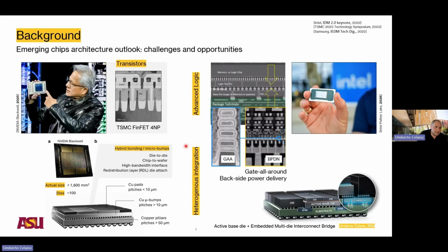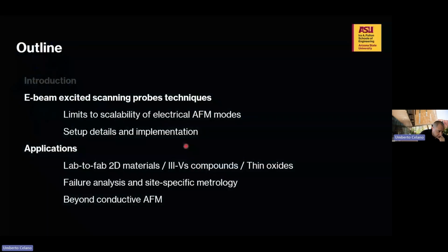So we try to plug in a little bit of the different techniques that are out there and try to push them to the limits of what can be done to probe logic, memory, new material integration, this kind of stuff. Now, with today, I'd like to guide you through some of these concepts where we use E-beam excited scanning probe techniques.